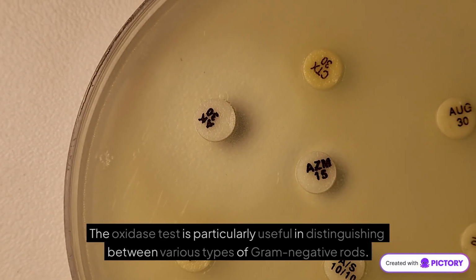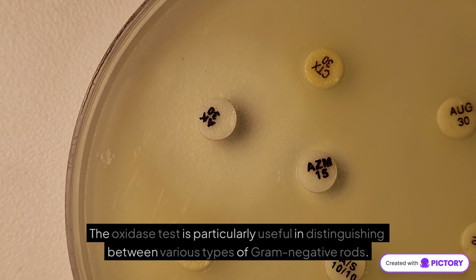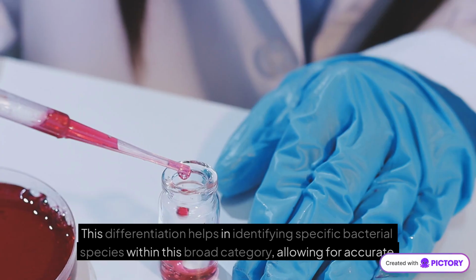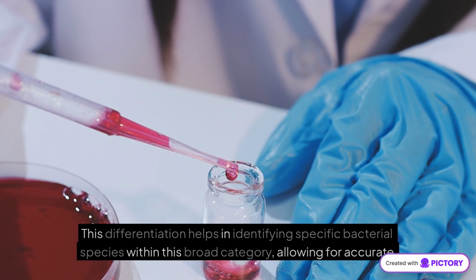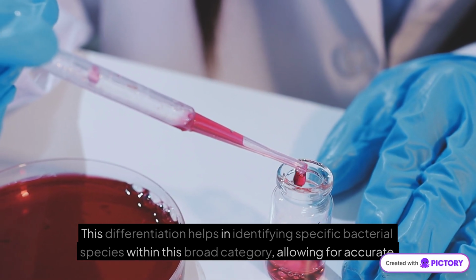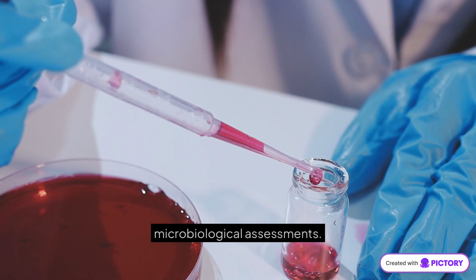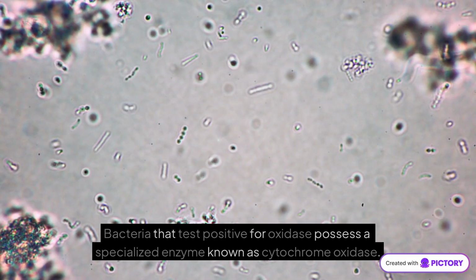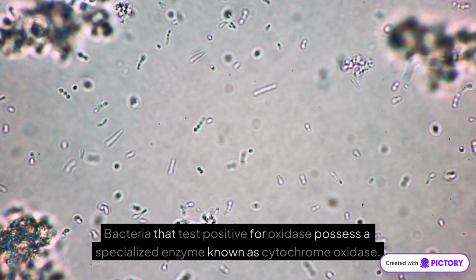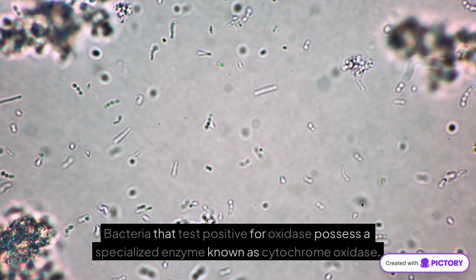The oxidase test is particularly useful in distinguishing between various types of gram-negative rods. This differentiation helps in identifying specific bacterial species within this broad category, allowing for accurate microbiological assessments. Bacteria that test positive for oxidase possess a specialized enzyme known as cytochrome oxidase.